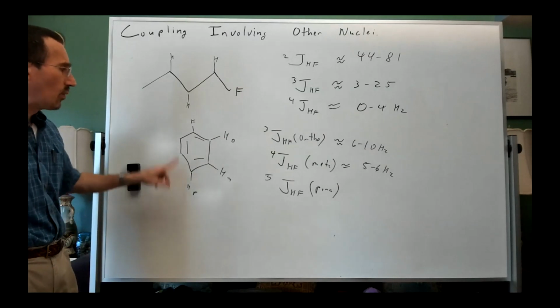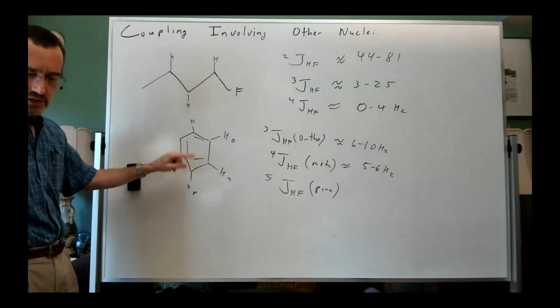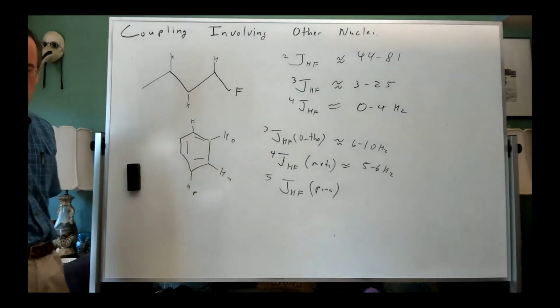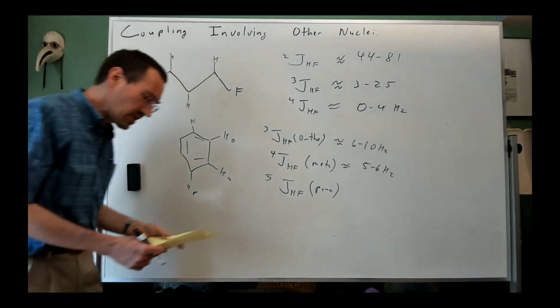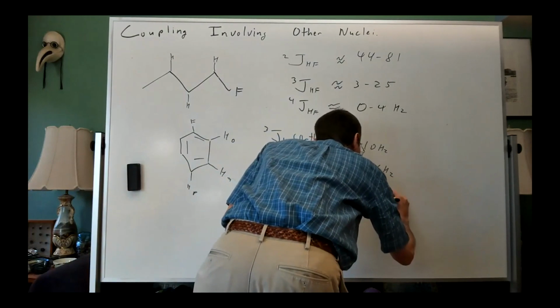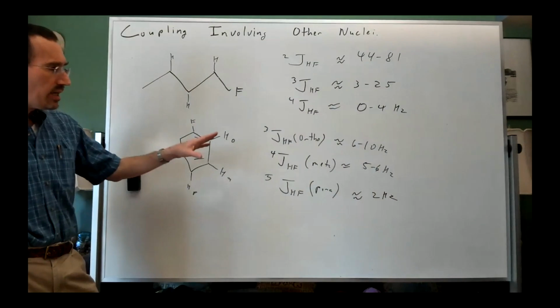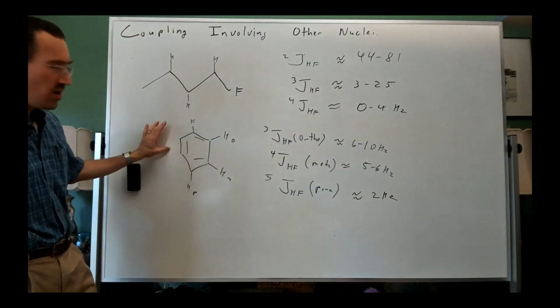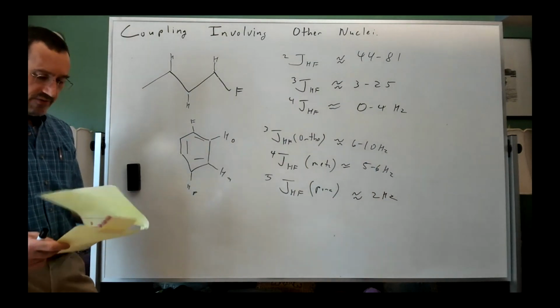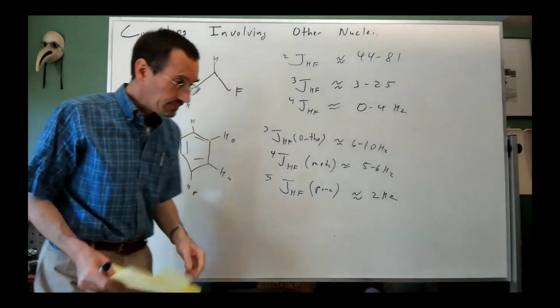One example was a particular relationship, I think it was the 2,5 positions of pyridine, where often we could get a slight para coupling of maybe 1 hertz. But here, it's about 2 hertz. So as you go on to look at some of the patterns in the homework that you see for fluorinated aromatics, you're going to find things to be a little bit surprising.